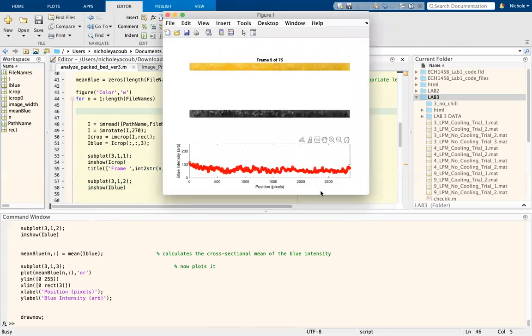Right, so you see that as time progresses, the saturation levels are actually increasing at the base of the column. The saturation is kind of moving along the length of the column. So saturation is increasing throughout the column. It remains the lowest at the top of the column. Now, something to point out as we watch the rest of these frames progress is that the maximum intensity or the maximum saturation sometimes doesn't occur at the very base of the column, although it should.